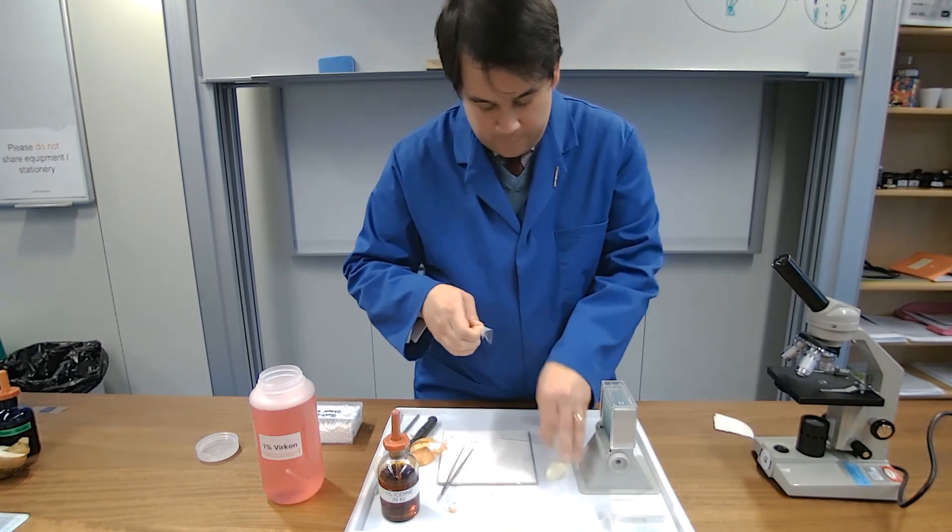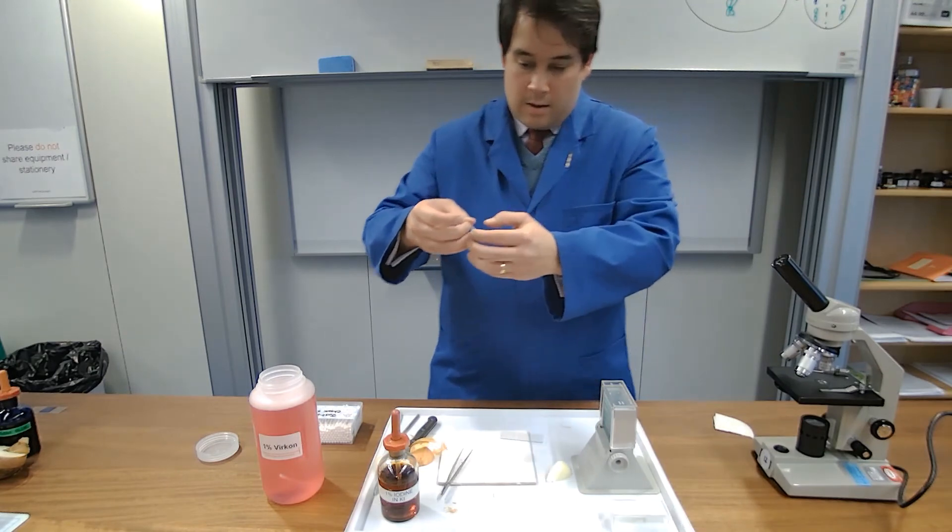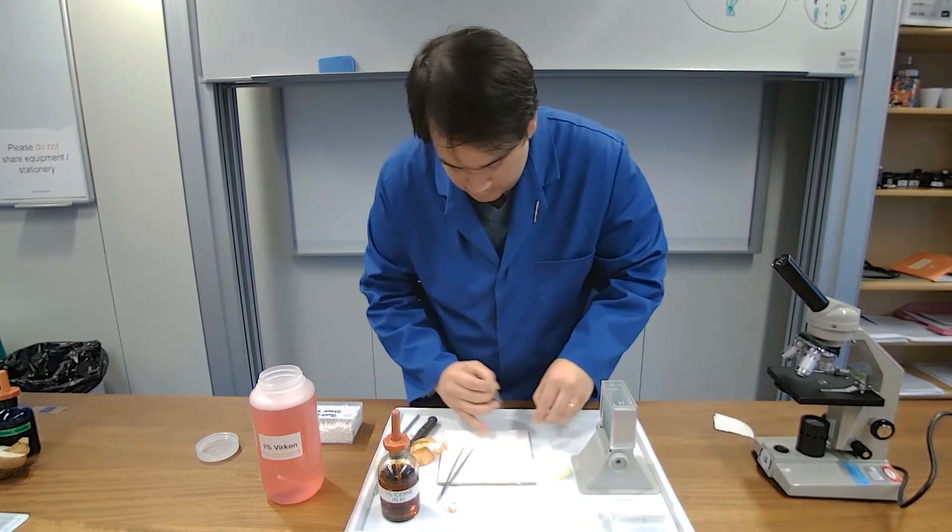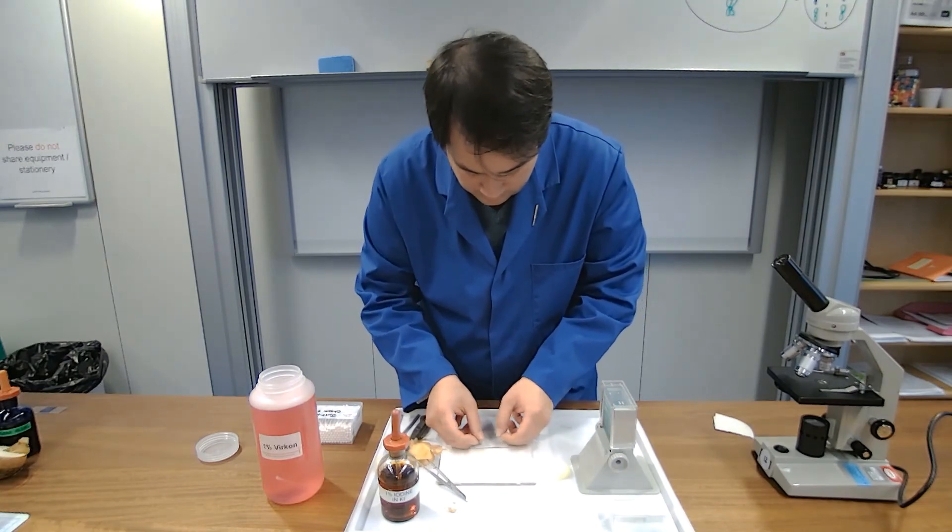So we're taking a very thin layer of the film here out. There we go. A nice thin layer of onion. I'm just going to take a little bit of it actually. This is quite a lot.